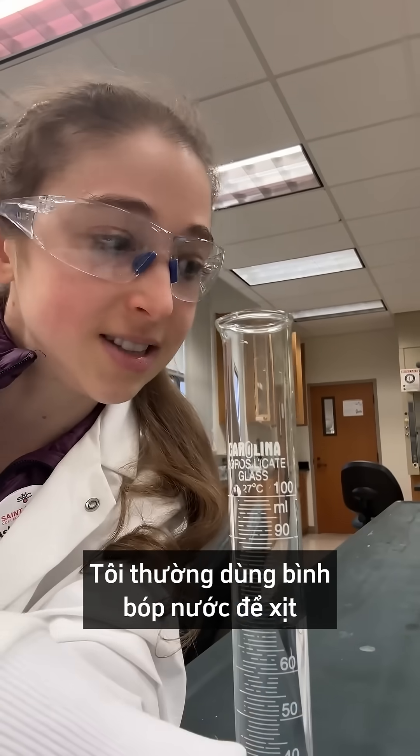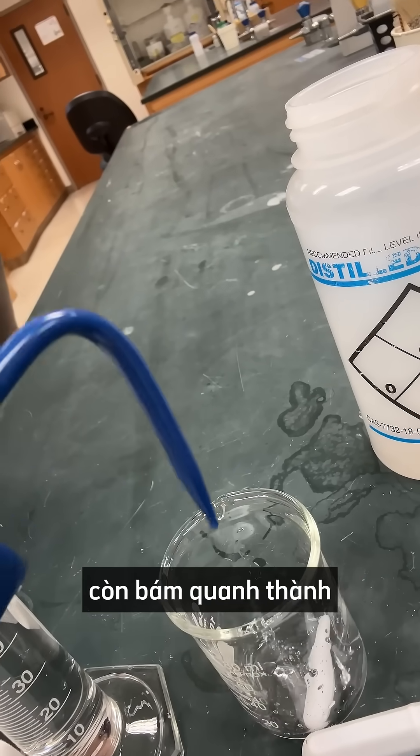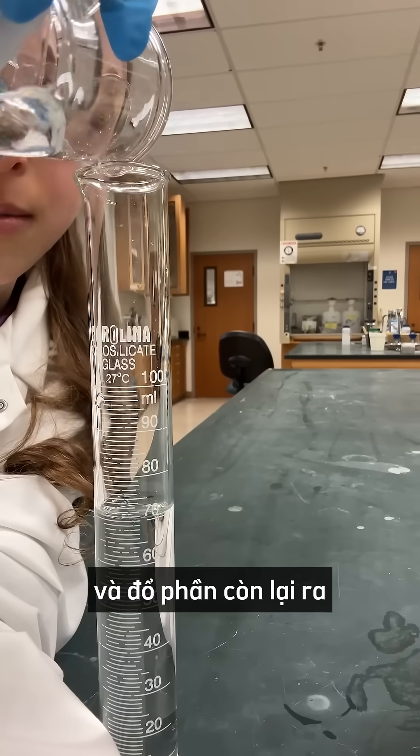Now what I like to do is take a squirt bottle and squirt around the stir bar, kind of get anything — any drops that were on the side. Swirl it around a little, get it all off. If the magnet goes back on, pour it in.